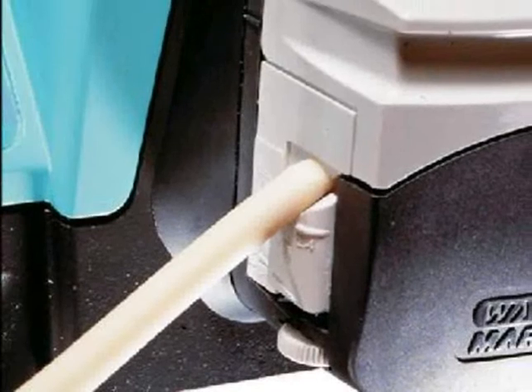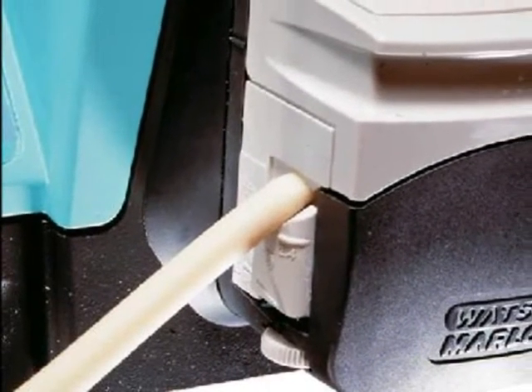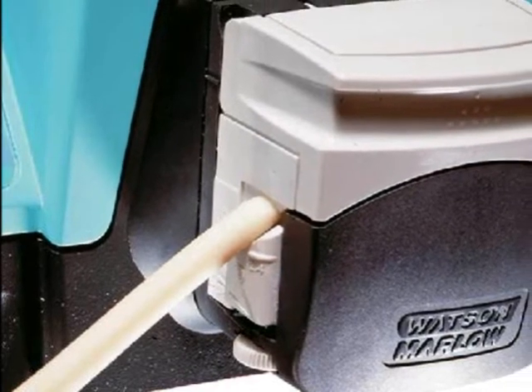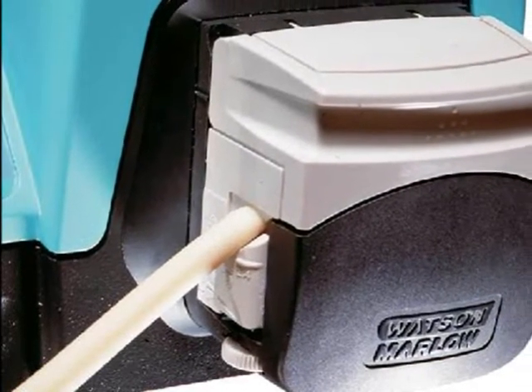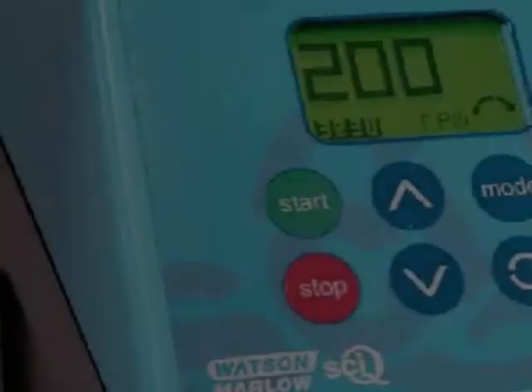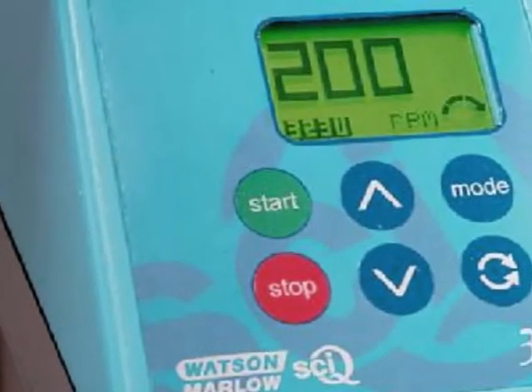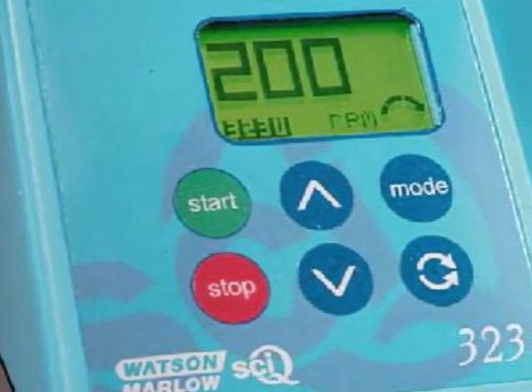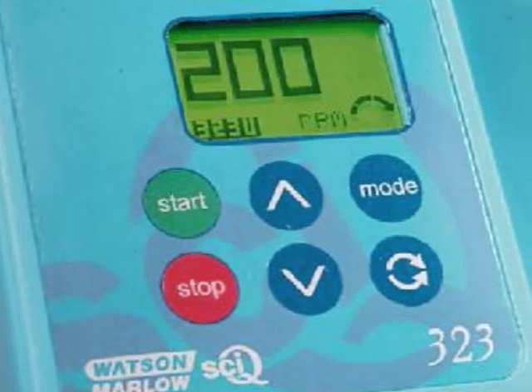They come in single or multi-channel benchtop options with manual, remote, analogue, and RS232 control, and an assurance of incredibly accurate dispensing as standard. Each model provides a precision brushless DC motor with exceptional servo quality, giving precise speed control and zero maintenance.